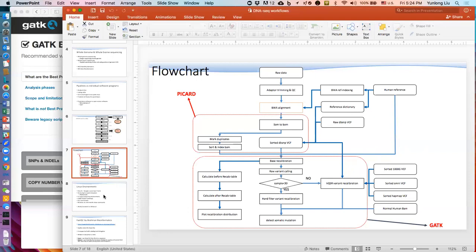Okay? And also that indexing step at Picard, your BAM file is indexed, sorted, and marked, but it also generates another file. It's a BAI file, and there's been a misconception out there that a BAI file is a BAM. It is not. Your BAM file is your indexed, marked, sorted BAM file. A BAI is basically, consider it in general, a table of contents. It's a different type of file that goes with that BAM file to show that you now have a BAM file that is indexed. It always generates two: the BAM file that's indexed, and then the BAI file, so you can confirm, yep, we did this. Does that help? But it can be BAM or FASTQ.